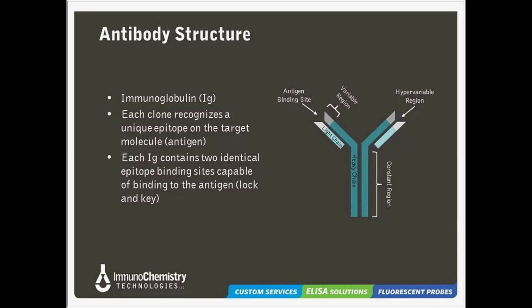All right. Everyone's seen one of these in Immunology 101. Essentially you have your IgG, and we say Ig because some people use other types of antibody isotypes for the ELISA. But in general, it's an IgG, and it has its basic hypervariable antigen binding region at the top, and within that region you have what we call a paratope.